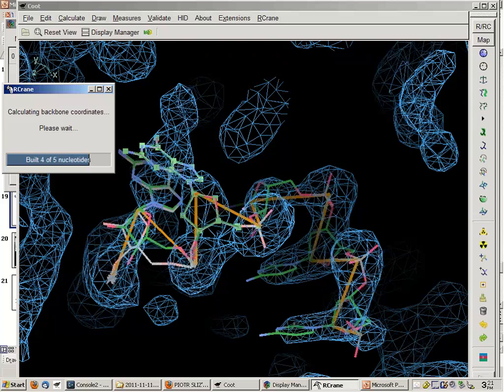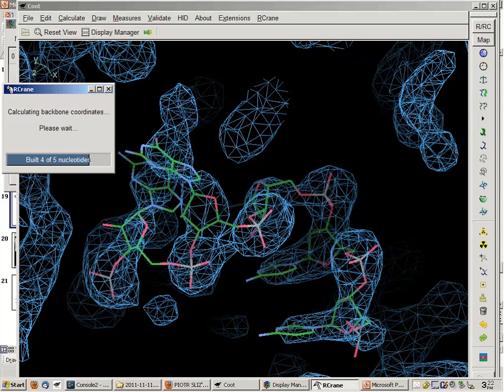So one question from the audience here: the minimization you're actually doing here on the screen, is it using the same type of calculation as Coot would use to regularize? Yeah. So it uses the same minimizer that's built into Coot. The idea is basically the same as the regularization, where I am paying attention to density, but very, very slightly.